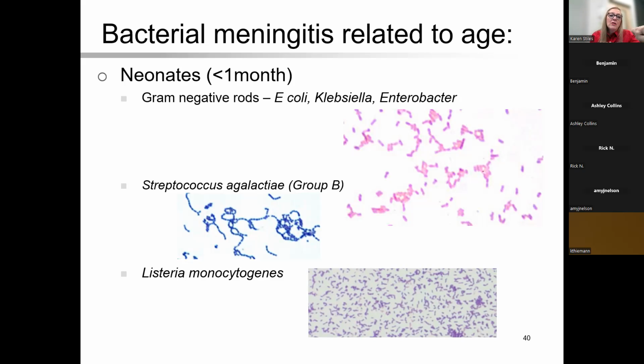I've had people call listeria a bacillus species, and that's not correct because they are two different sizes totally. So if an employee or staff member even questions it, they can grab both slides, look at them side by side, and then make a better determination of what that particular slide is.